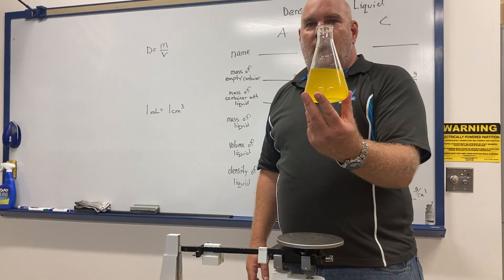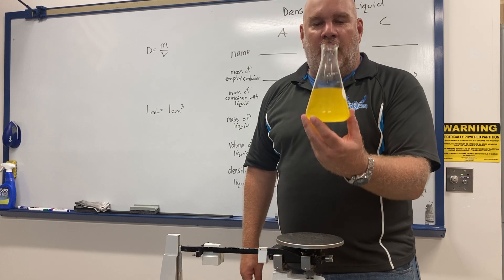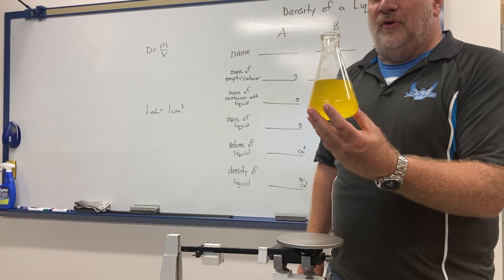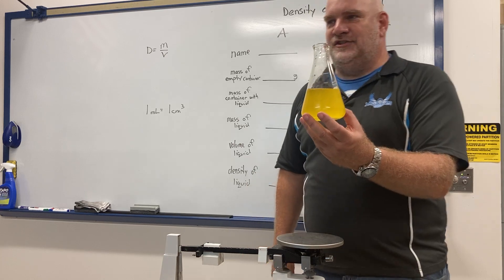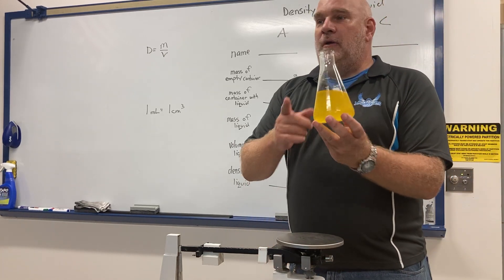The first liquid we're going to find the density of is — horse urine. I almost lost my life collecting it, hooves flying by my head. Just kidding — this is actually salt water with some food coloring in it. We're going to find the density of the salt water.